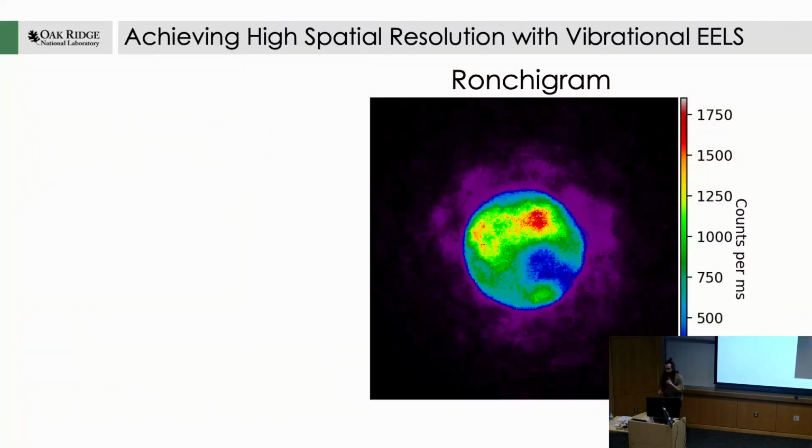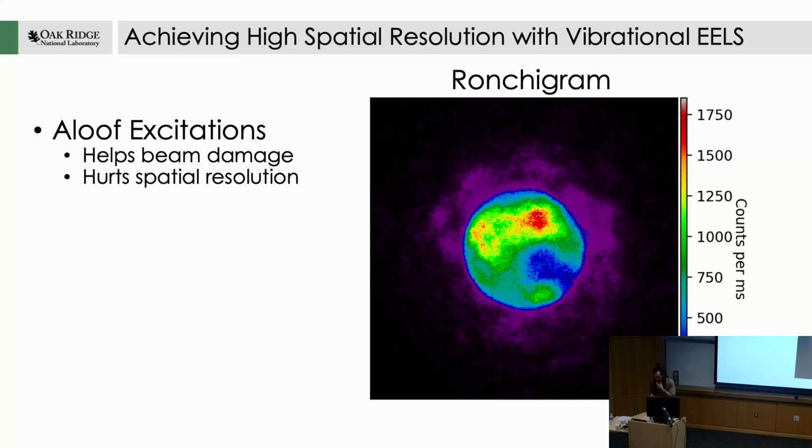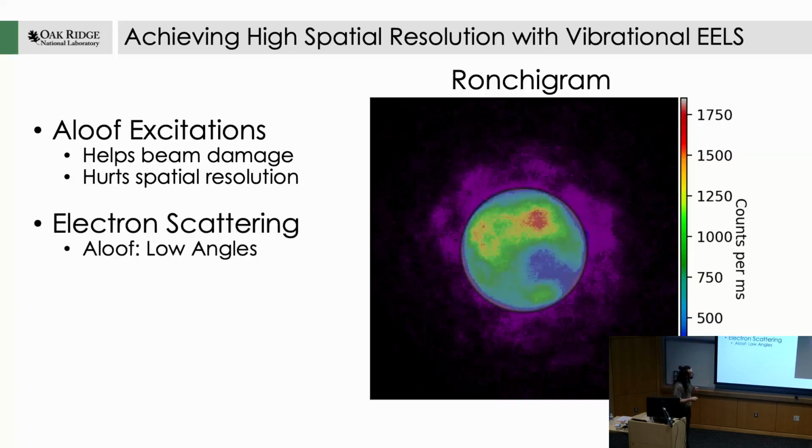I talked briefly about how there's a little bit of delocalization in these modes. That's because the electron beam interacts with the sample through a Coulomb effect, right? The electric field of the electron beam sees the sample and you interact with it. This forms a delocalized interaction that you can use to probe vibrational modes. But sometimes you don't want delocalized information. Sometimes you want localized information. And we can get this by controlling the experimental geometry of the collection. Normally you collect what's called a convergent electron beam diffraction pattern. Essentially it's the angular space distribution of your diffracted electrons. The width of this is the convergence of your beam.